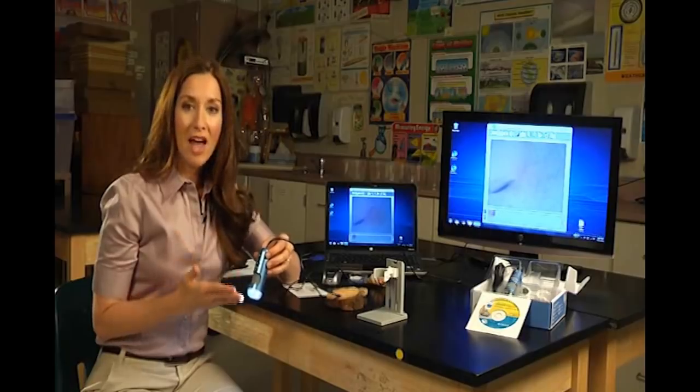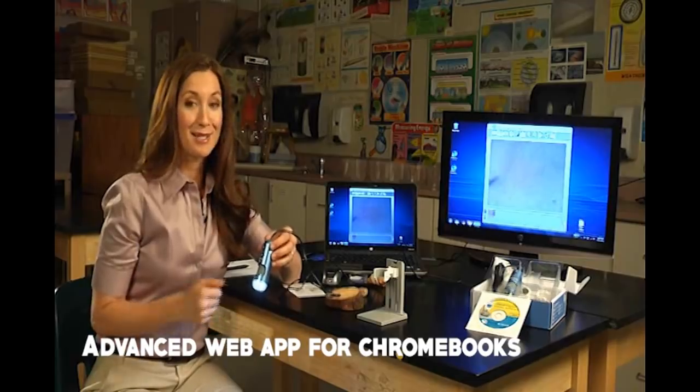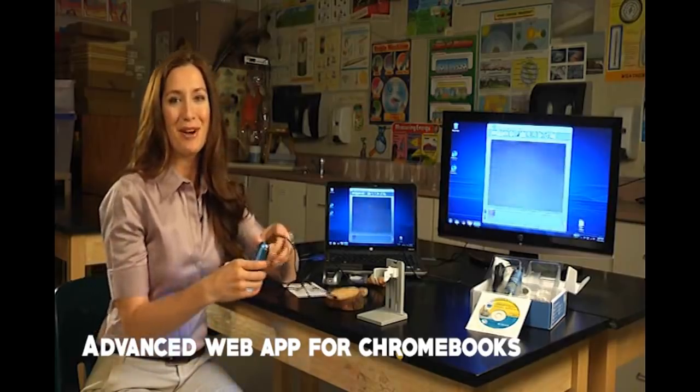Also, it's great when you're viewing live images because you're going to see an incredibly crisp, clear image. And it's extremely easy to use. Let me show you how it works.